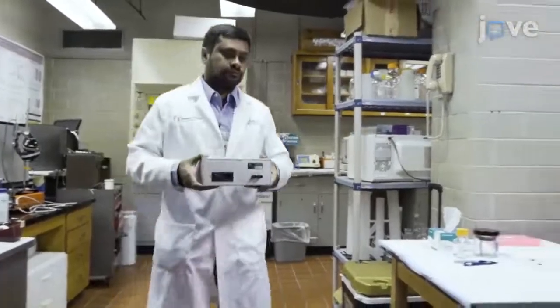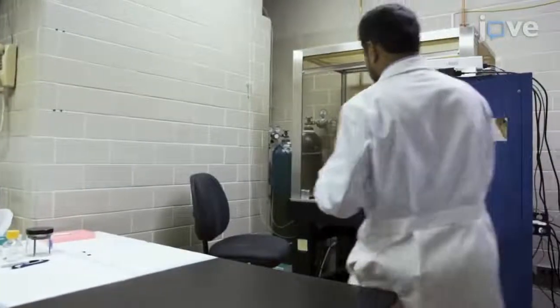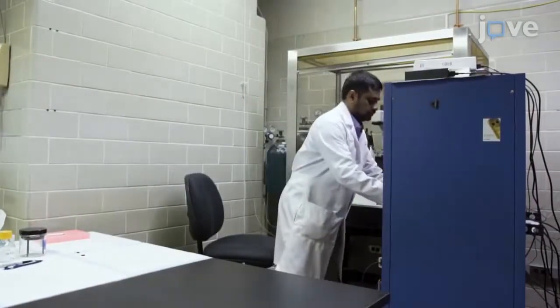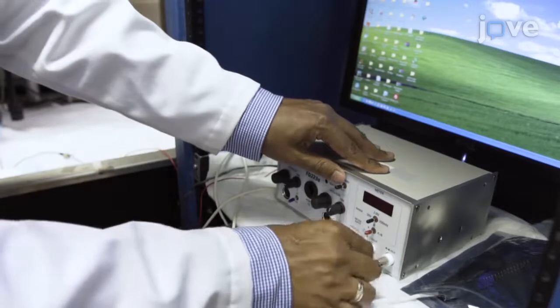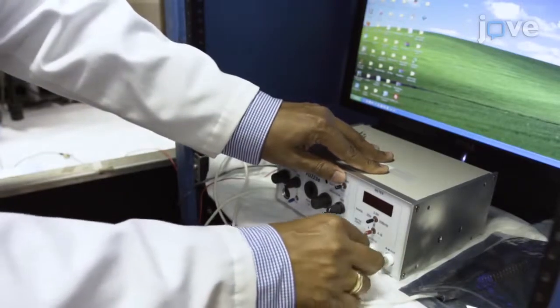Before beginning the procedure, place a dual-channel differential electrometer amplifier close to the vessel chamber at the desired location. Use a BNC-BNC cable to connect the output of the amplifier channel A or B to the channel input of the digitizer.